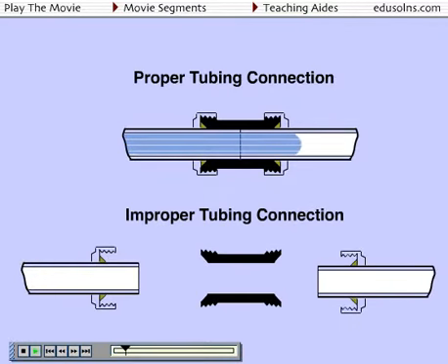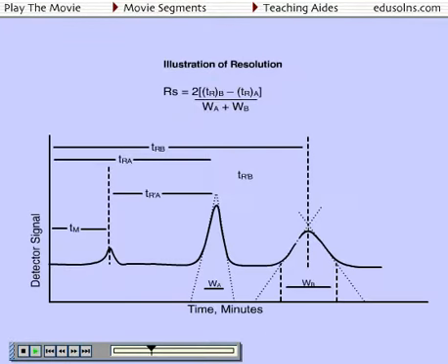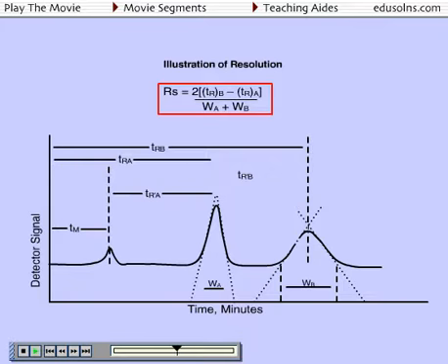The flow rate of liquid pushed through the column and the quality of the column packing come together to affect resolution. In order to mathematically relate these parameters to resolution, represented by R sub s, we must first develop a concept known as H, the theoretical plate height equivalent.